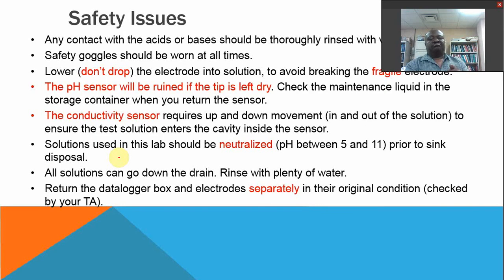Safety issues? Sure, acetic acid. These are acids, weak acids, but all the same, keep your goggles on at all times. It should be done. With this lab, it took me 23 minutes. It'll take you twice as much, so it should be done in about an hour. May I suggest that you then hook up with your buddies and do all the calculations, and be done within the 3-hour time span.